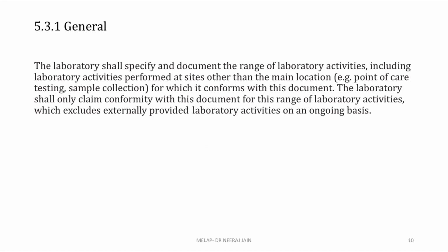Now you see laboratory activities in the standard. What they are saying, laboratory shall specify and document the range of laboratory activity you are specifying. See, in our laboratory, we are performing tests related to hematology and biochemistry, or we are performing tests related to hematology, biochemistry, microbiology, histopathology also, and also document, write down what all tests you are performing in hematology, what all tests you are performing in biochemistry.